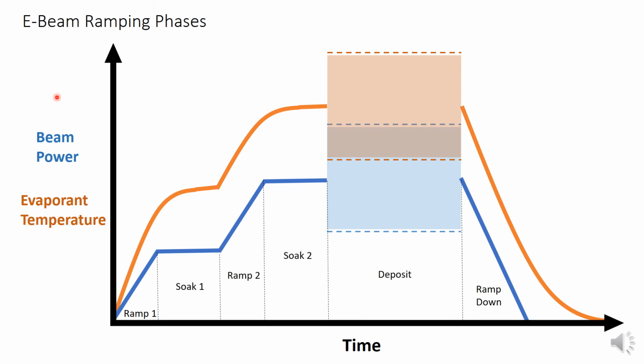You should see power stabilize with the rate, and the two should remain relatively constant throughout the process. If you suddenly see power increasing by more than about 10% and the rate is steadily dropping, that is an indicator that you've run out of material or run to the bottom of the crucible. If material levels are properly checked and maintained, this will not happen during your run.